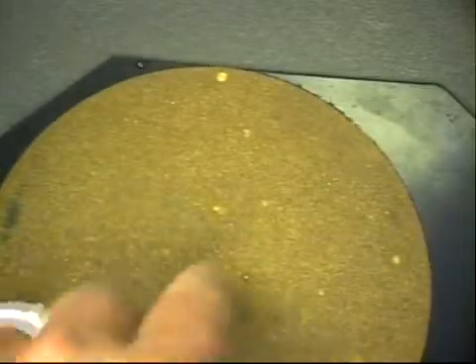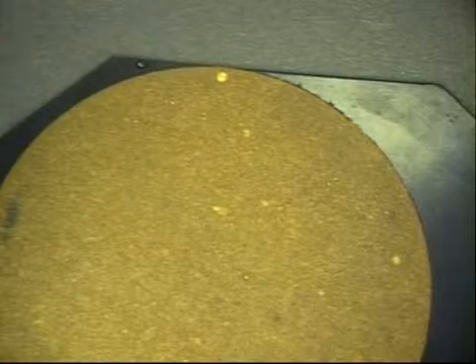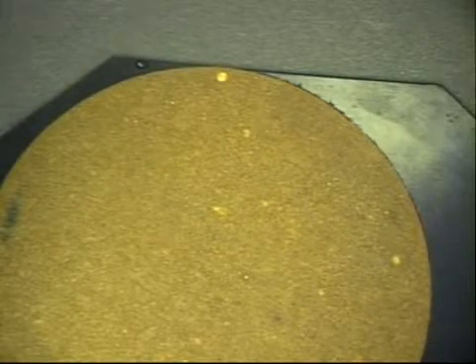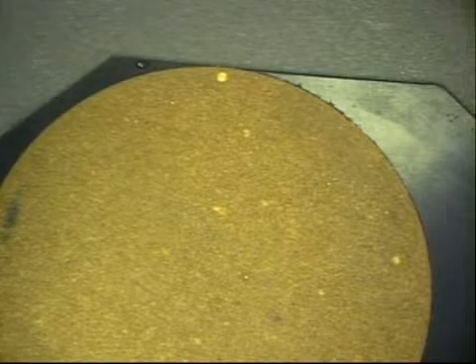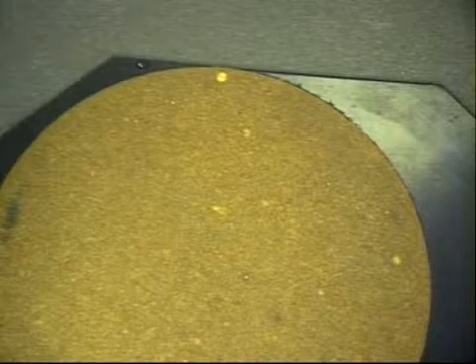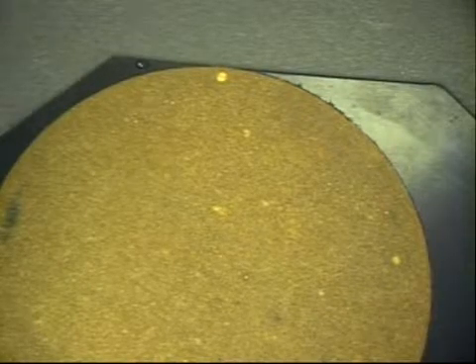You can see now that they're white specks, or light colored. What has happened is the wax has, in the process of making the hand sheet, drying it on a hand sheet dryer, the wax has now melted and come into the linerboard or into the OCC and made the fibers waterproof. With the water has turned all of the unaffected fiber dark, but it has remained lighter colored areas where the stickies are present.